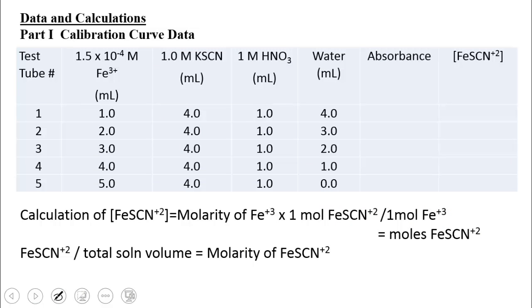You need to make each of these 5 solutions and measure the absorbance of each of these known concentrations of solutions in order to generate our calibration curve. We'll be measuring the absorbance using the Spec 20.